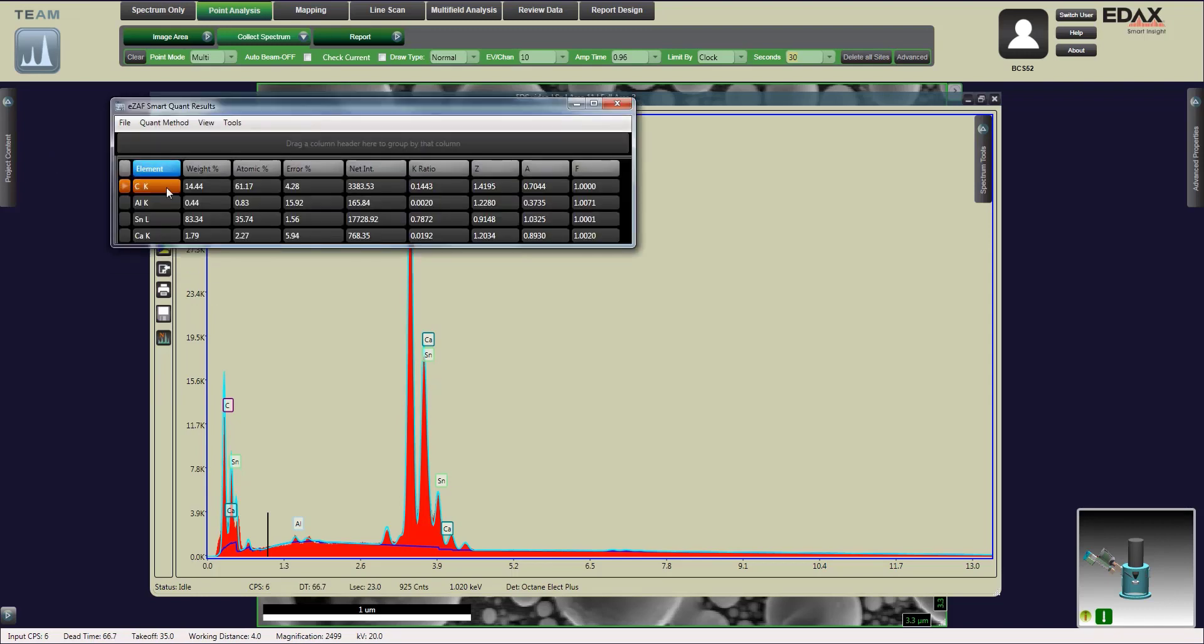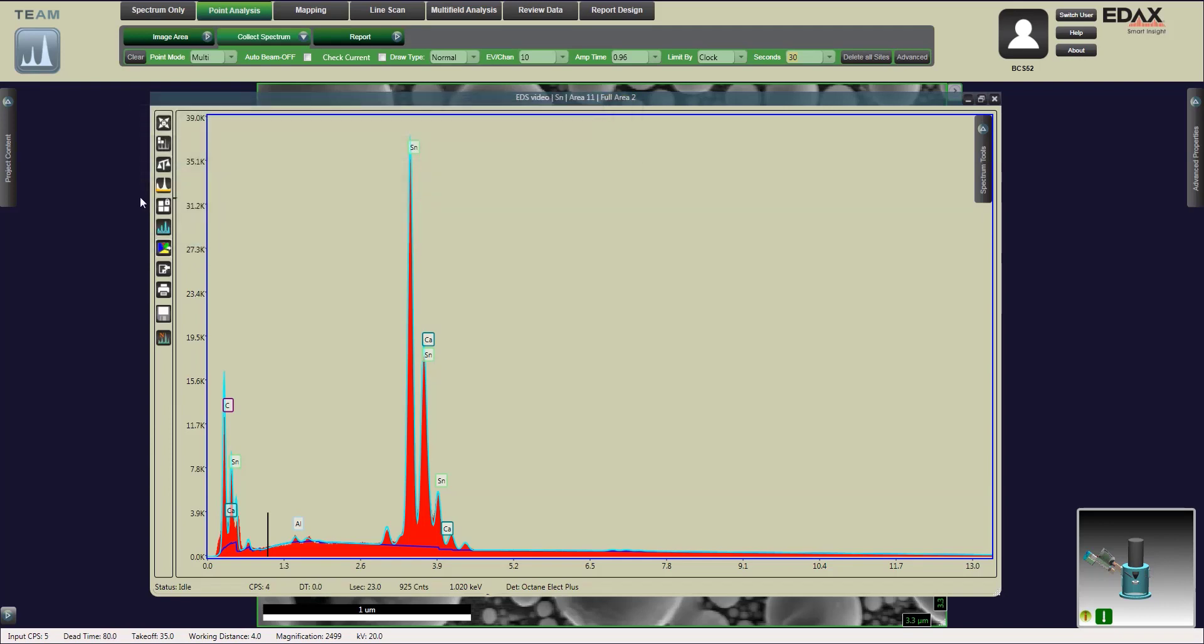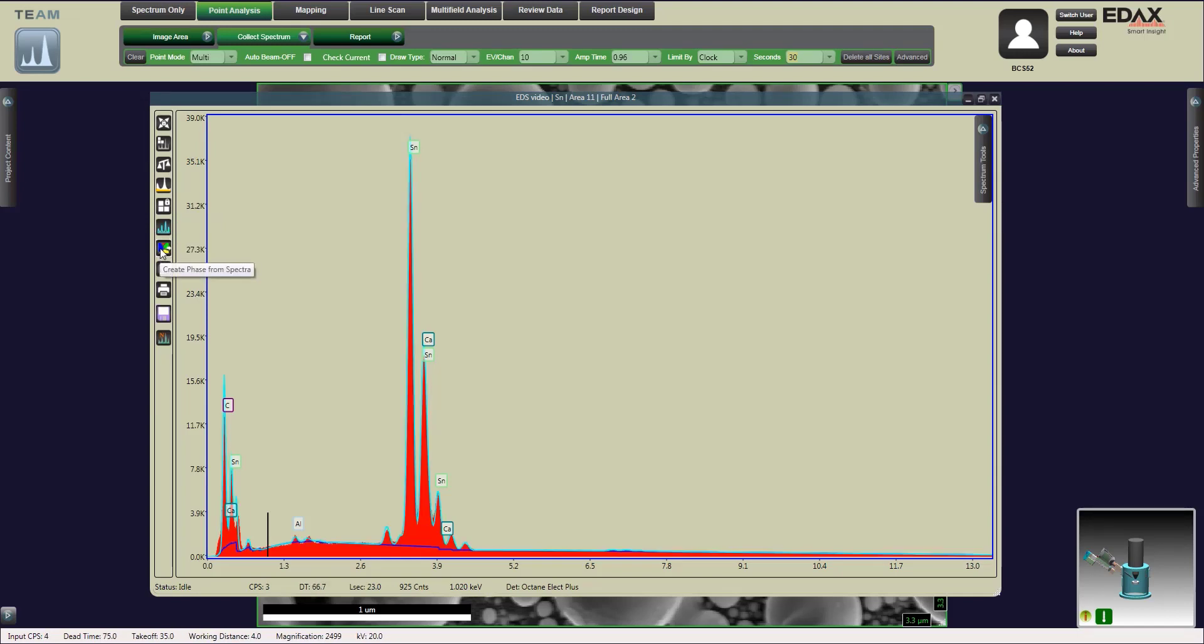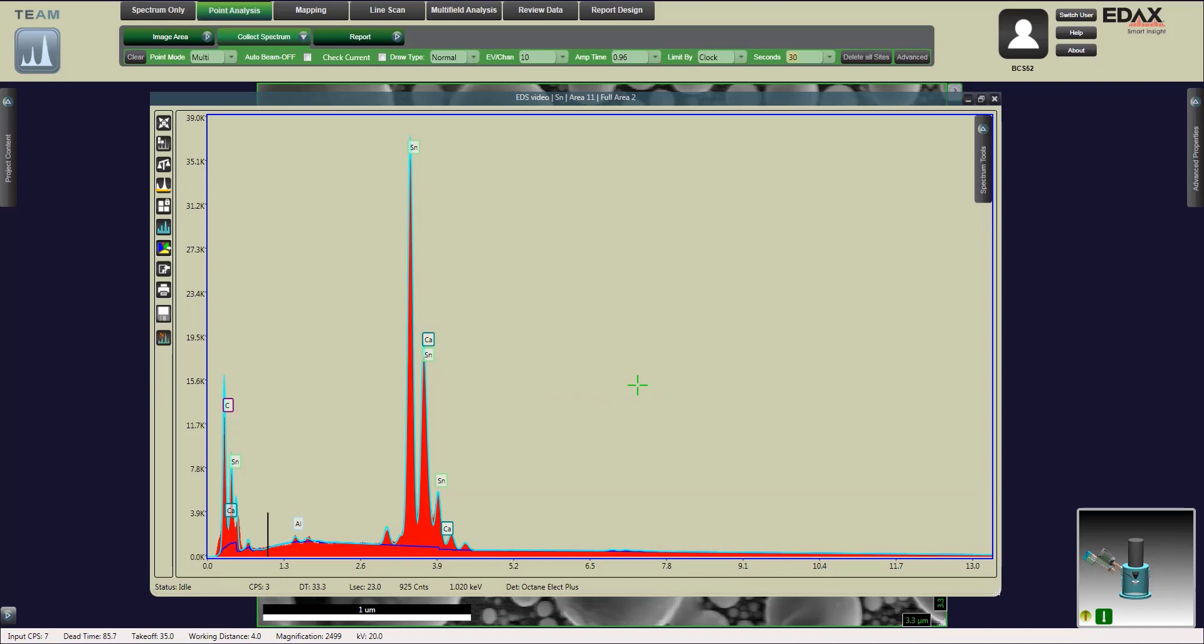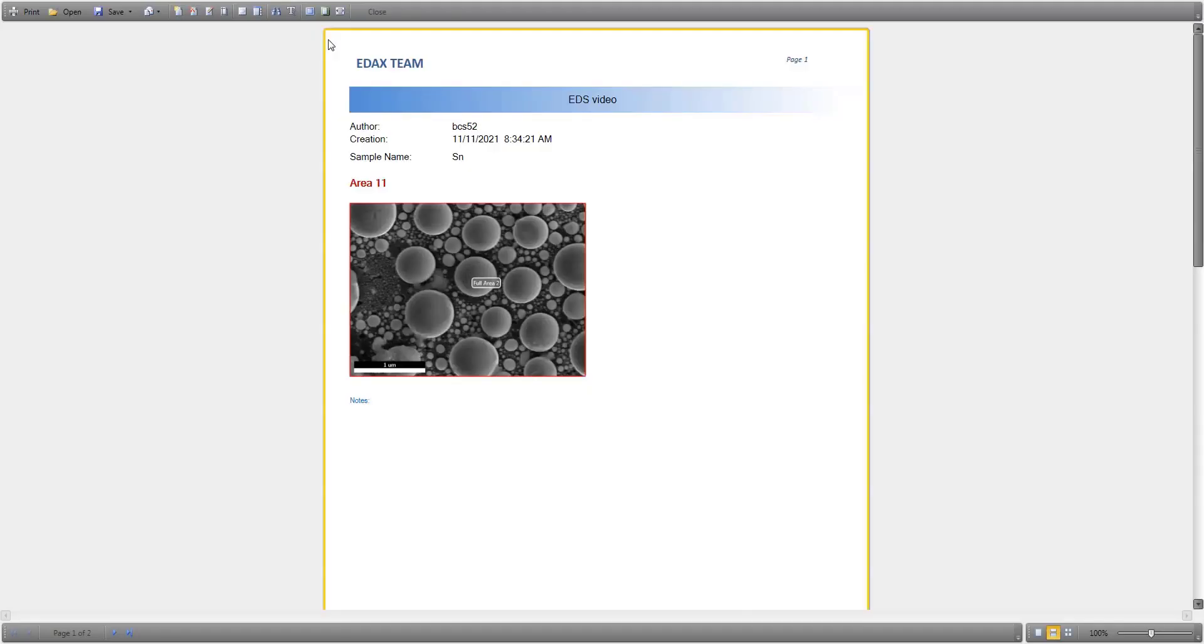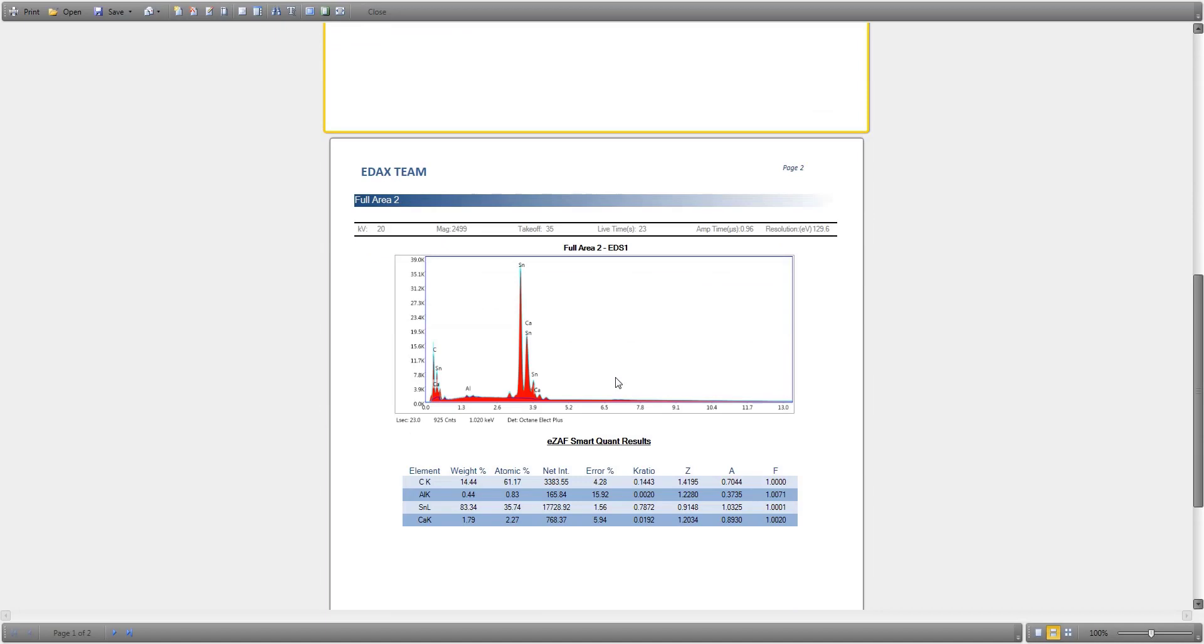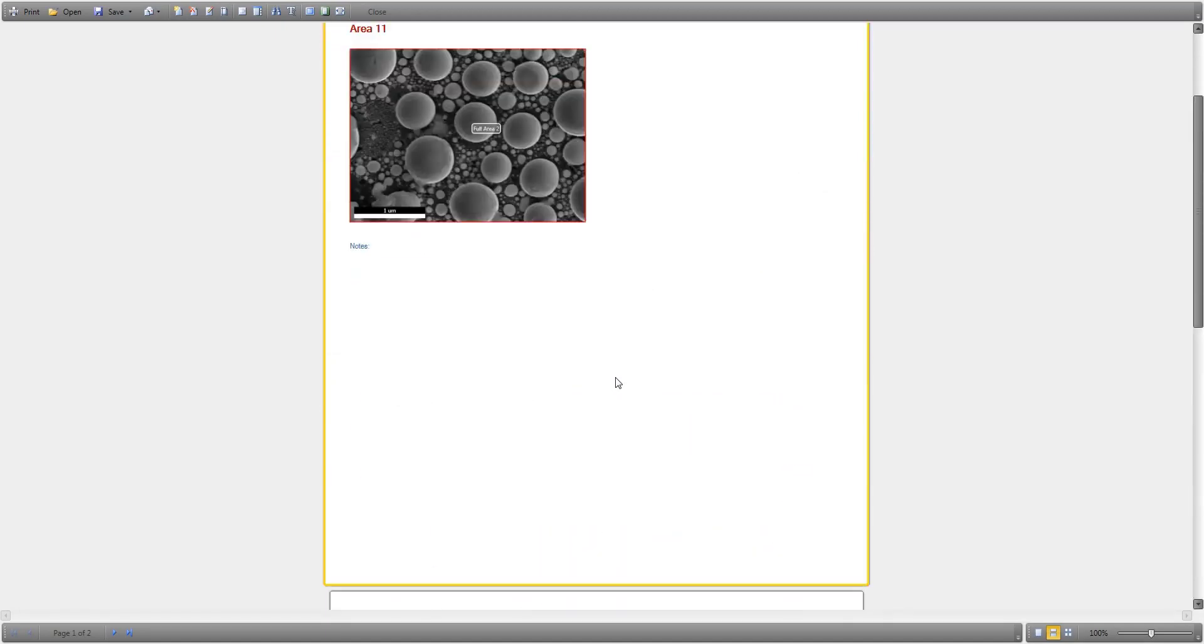We're going to relook at the elements. Aluminum is a little high, but anything over 10% error we really want to double check. Let's take a look at the report. Our report is going to give us our image area and also our data along with the elemental composition that we have.